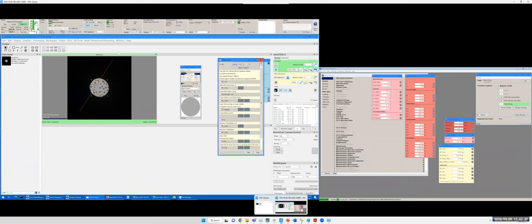Before we jump to the mode where we do atomic imaging, I want to quickly go back. This is still good. This one you need to put the VOA in. Okay, it's still aligned, and put this in. Okay, so a tiny amount of movement along X, right? So I want to change a tiny little amount. Okay, then check this one. Perfect, this one. Okay, it's off again. This is normal because after aberration correction, you change some coma, so this alignment may be changed. Okay, now it's perfect. Do you see that?